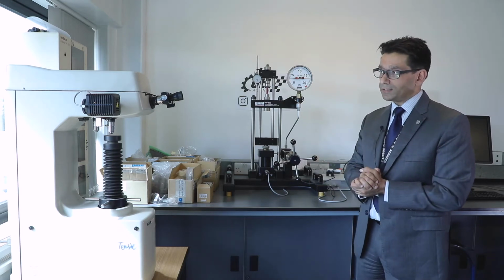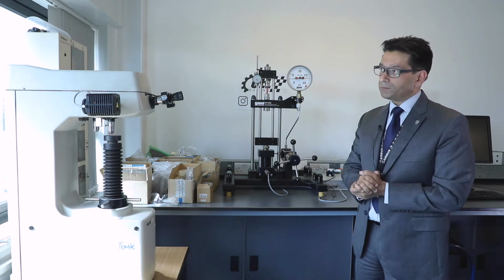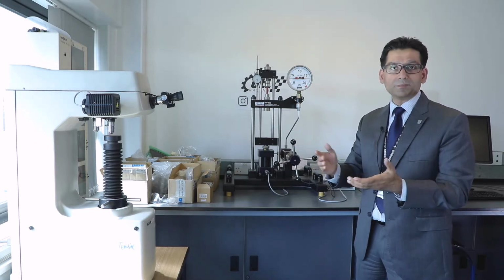So the indenter drops very slowly and it produces an indent. And with the aid of this microscope, they capture the dimensions of the indent, and that's how they compute the hardness of the sample.